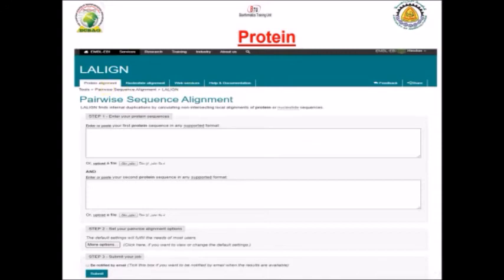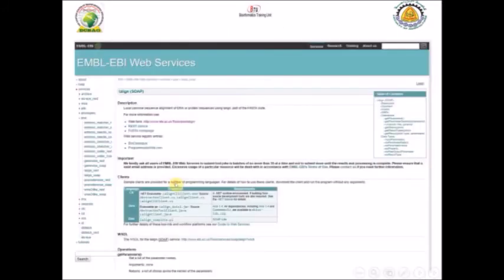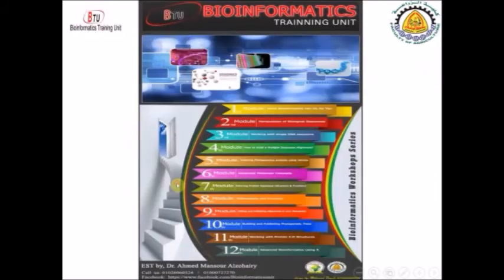If you click on it, you can find the same interface as EMBOSS Water — the same principles. You can put your two sequences either here or here, or upload them, and after uploading them you can click submit and get the result. As before, you can use protein or nucleotides, and the tool also has web services and help documentation for those who need further reading.